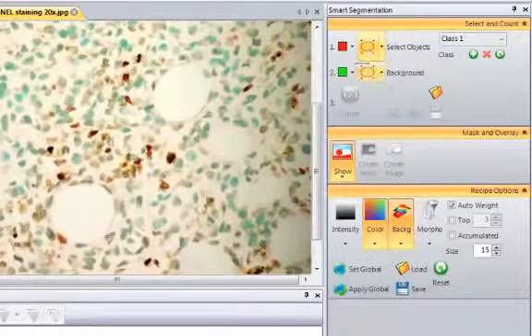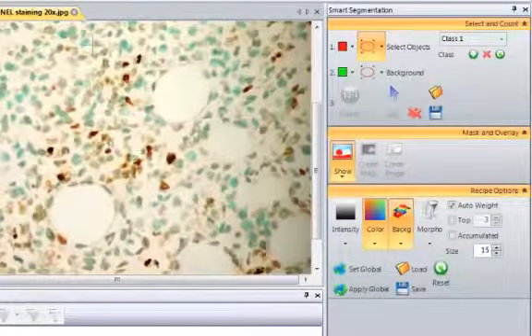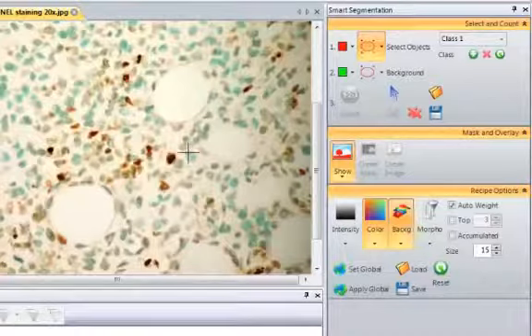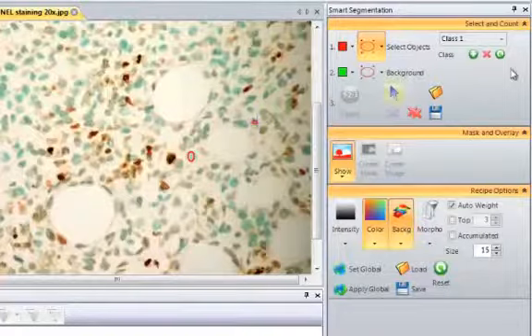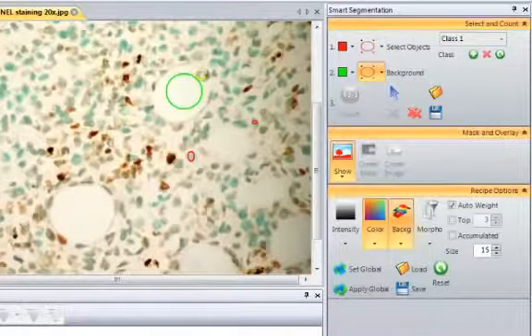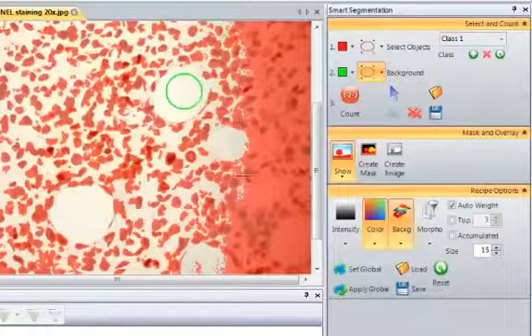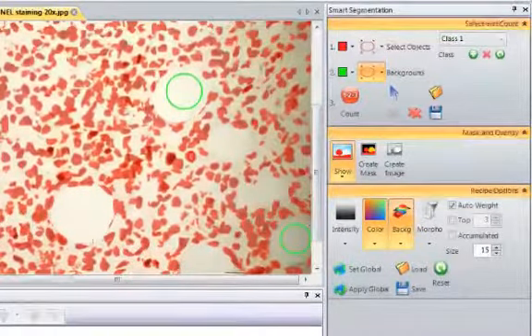And then we just click and draw a region on the object, on the image, to select what constitutes an object of that class. As soon as we select a background region, we see the segmentation, and we can then add multiple objects if necessary. In this case, as we mentioned earlier, there's a problem with shading, so we have everything on the right here being considered to be an object. If we just add another region, everything else is selected.